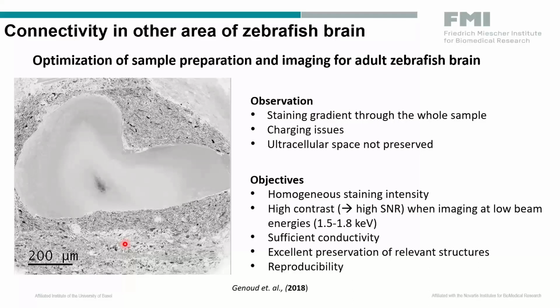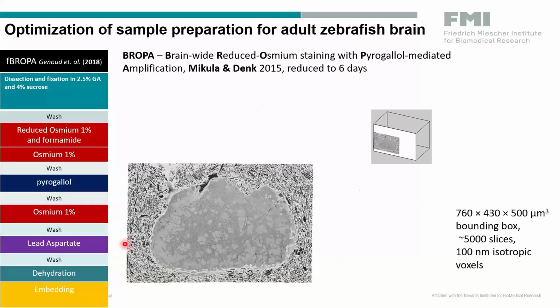And we also needed reproducibility. We achieved that by being inspired by the protocol from Mikula and Denk, who developed the protocol called BROPA.